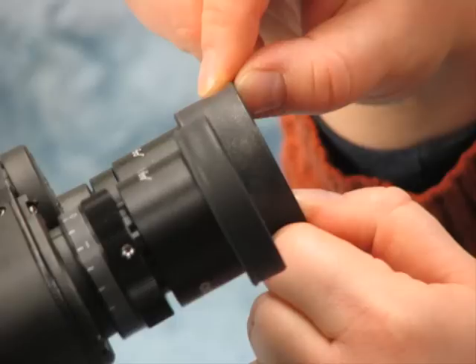The eyepieces themselves have little rubber cups at the top, and normally these should be folded up. The one that my fingers are grasping is folded up, and people without eyeglasses would use them in those positions. The eyepiece that's closest to you is folded down — if you wear eyeglasses, you would want to do this with both of them.